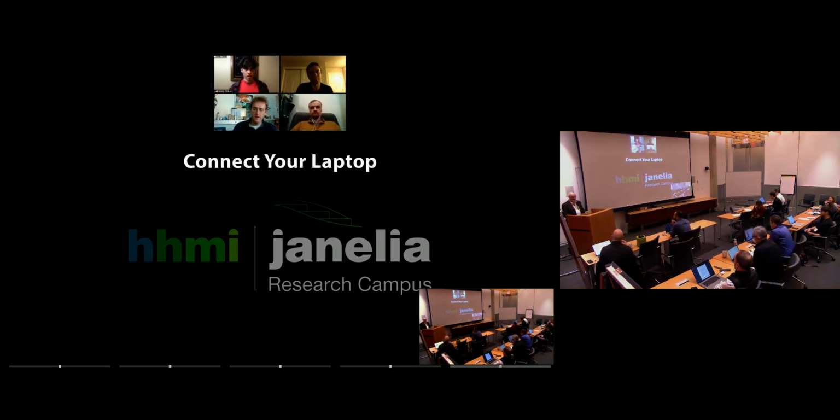If I have got some time, then I'd just like to quickly say, in Micro-Manager, we have a few issues. One issue is we're building an autofocus for our high content platforms, and so that's camera based, and so we'd like the ability for having a camera doing something other than looking at the sample. So the multi-dimensional image acquisition is really based around cameras looking at the sample, and so we would like a bit more sophistication there. When we're doing STORM, our file sizes, because we have very large fields of view, can be up to 50, 70 gigabytes, and so we want to be able to handle such large data files.